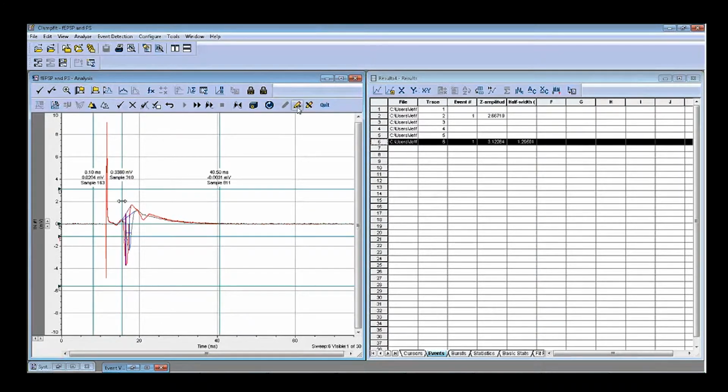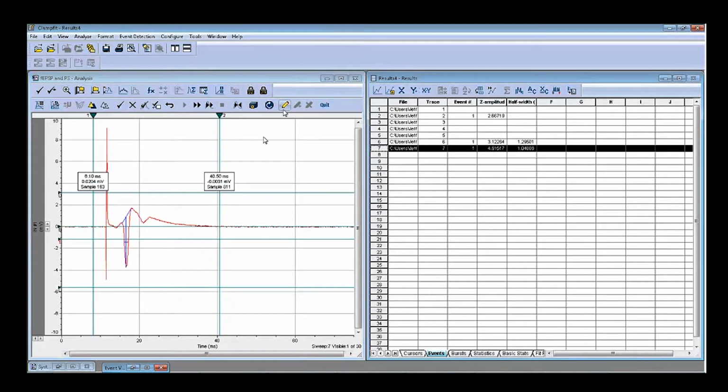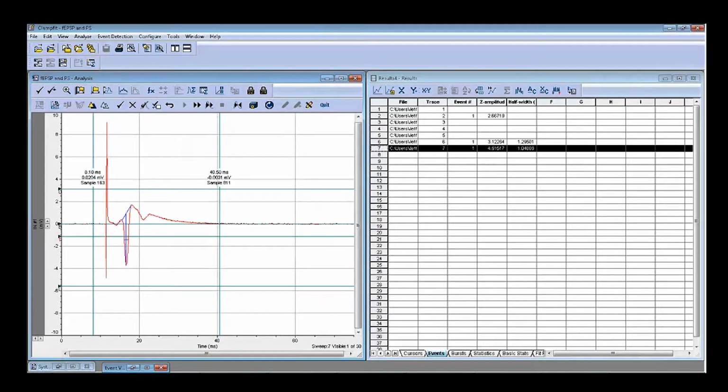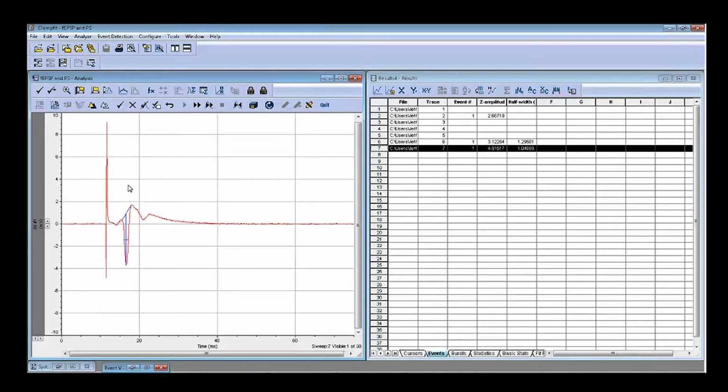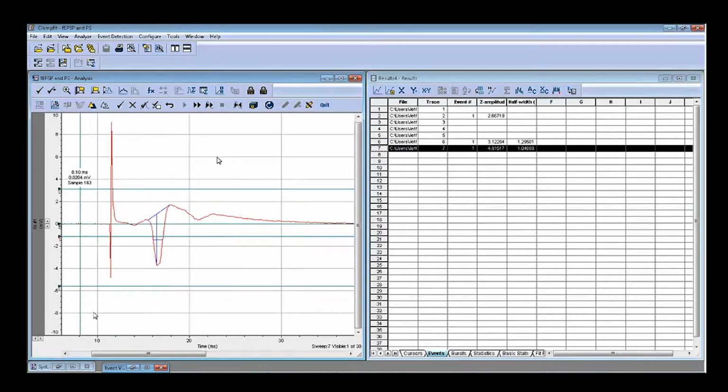And then you can click this one, okay? Right, and then you can accept it, okay? Now you can go back to here. You can try one more time. Now you can click here. What I want to show you.